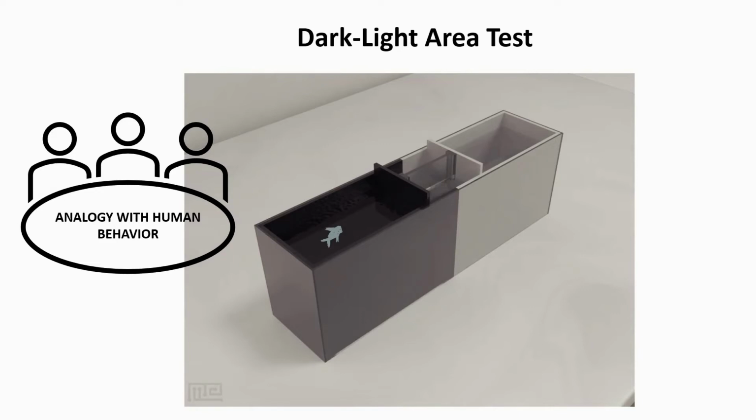Or the second example: there is a thief in your house who might hurt you. Then where would you go? You would definitely go to a place which is dark so that you can hide yourself. The same goes for the fishes. While you're working with a neurodegenerative model, the control behavior in this case would be that the fish will always be found in the dark area. Do it yourself, you will understand. The fish is always seen at the bottom of the seabed.